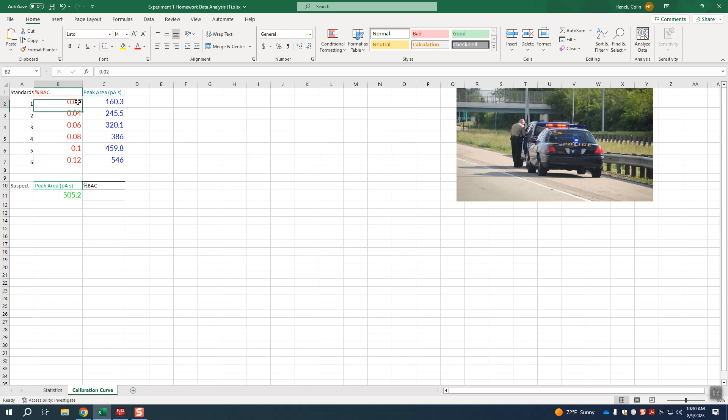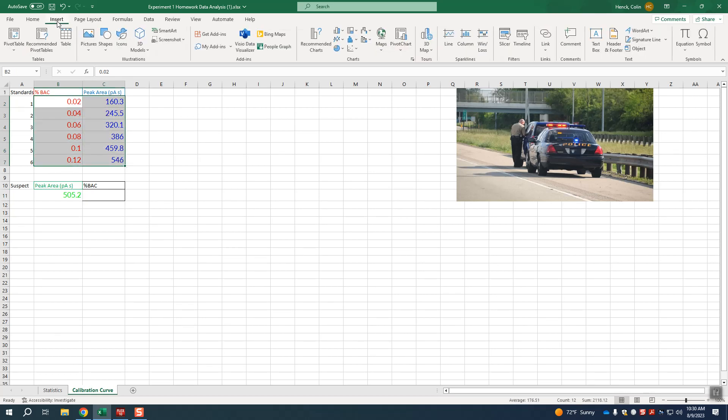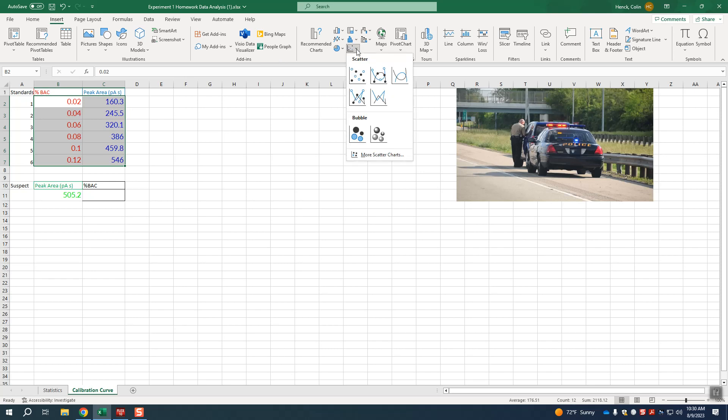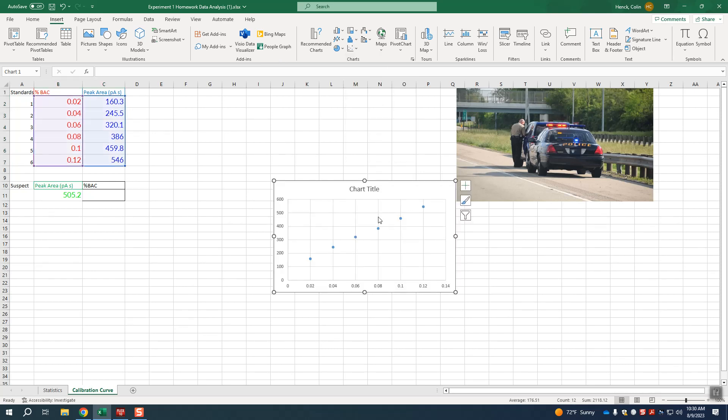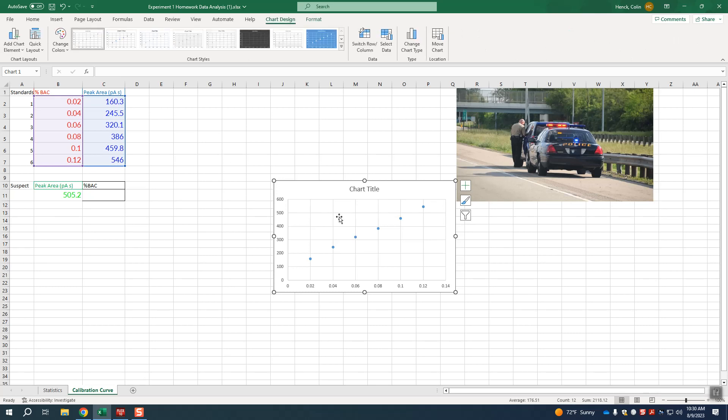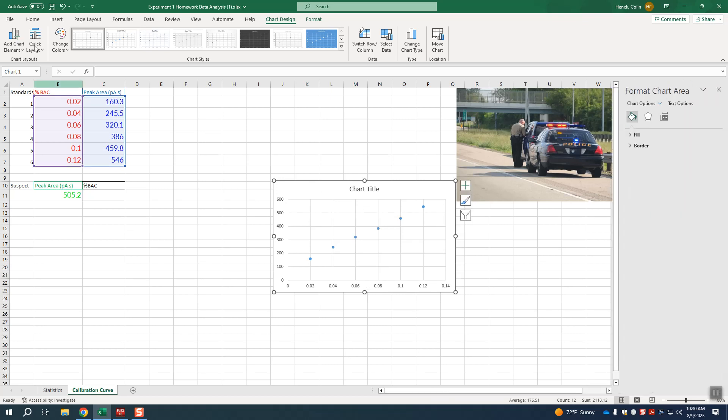Now we need to generate what's called a calibration curve. To do that we select all of the data, click on insert, click on charts, and do an XY scatter. Now if we were doing this for real we would want to go ahead and label all our axes and make sure we have all that good.